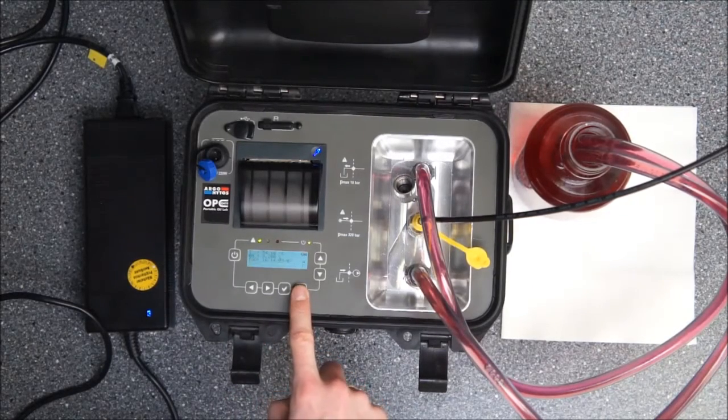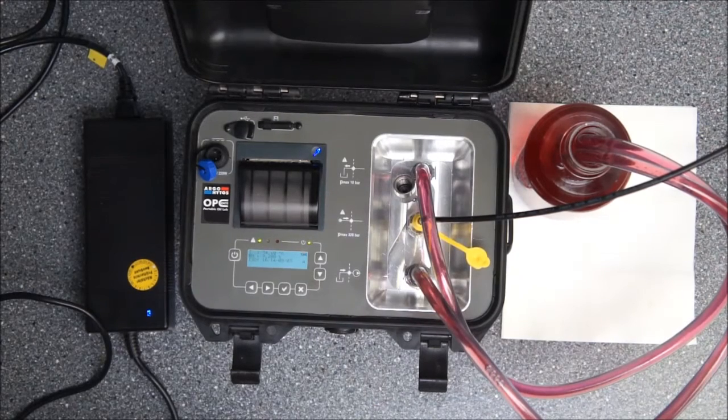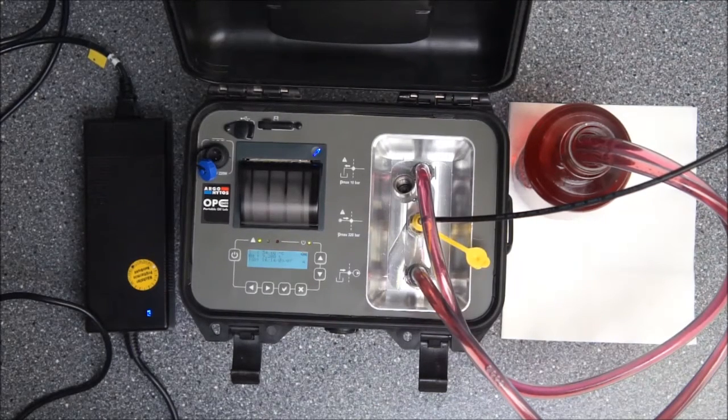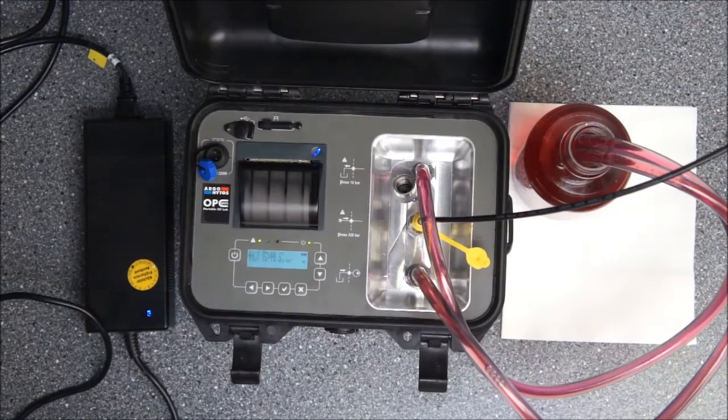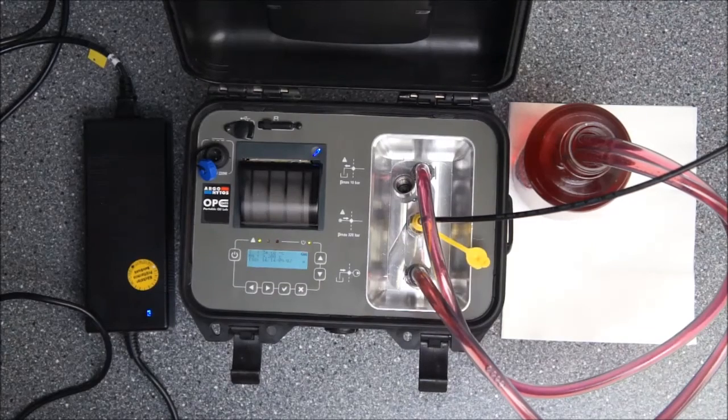I will now just stop the current measurement and also just stop our demo as we have demonstrated how easy it is to operate our new Opcom Portable Oil Lab. And we hope that you have quite fun with our product and you are satisfied.